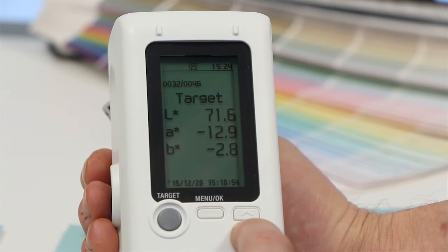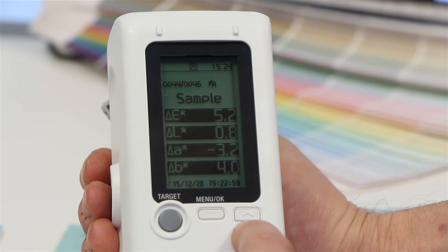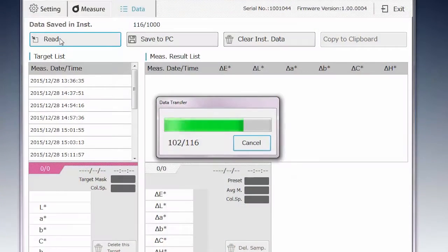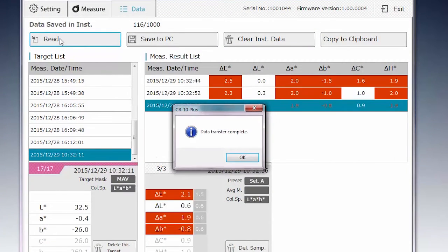You can store 1000 readings, a combination of target and sample data. You can also upload this data into the utility software and paste into Excel for further analysis.